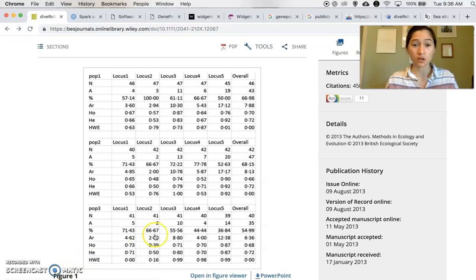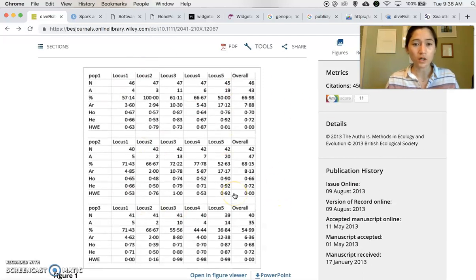First, what I'm going to show here is an example table that is provided in the publication associated with this diversity package. So I'll post this on Canvas if you're curious. But this table here is what the output is going to look like for that Excel file that we created by running that div basic command in R.